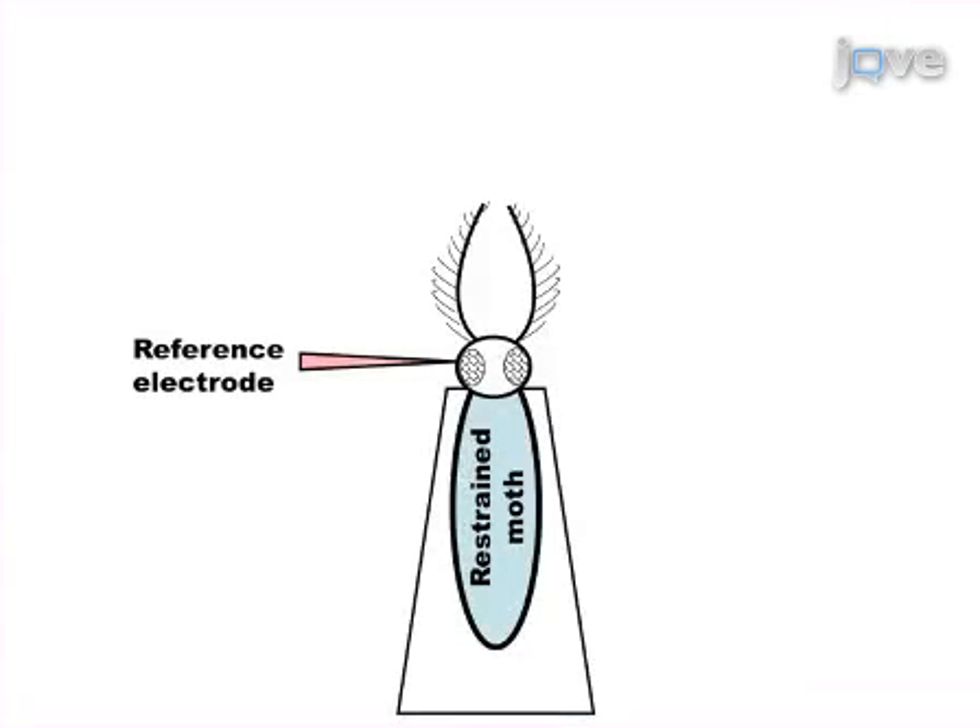As a first step, a saline-filled glass electrode is impaled in the eye as ground. As a second step, antennae of the restrained moths are inserted into a saline-filled glass electrode, which enables recordings of electrical responses in the form of an antennagram.